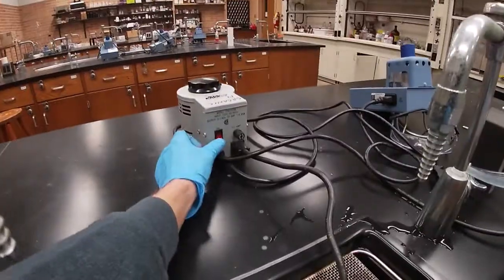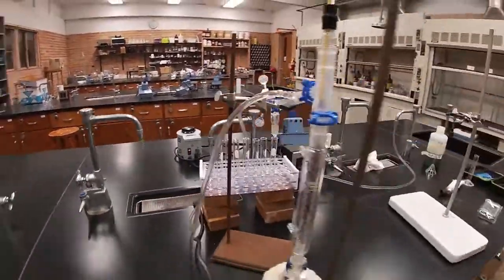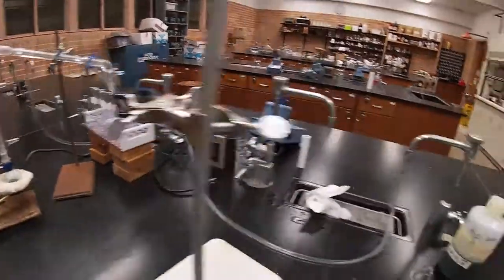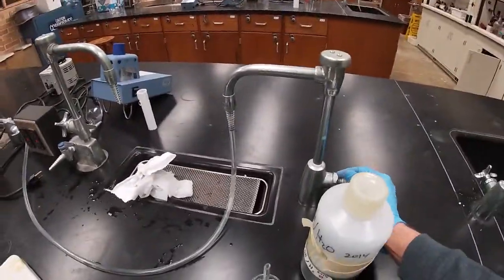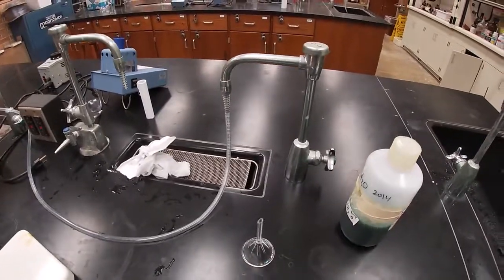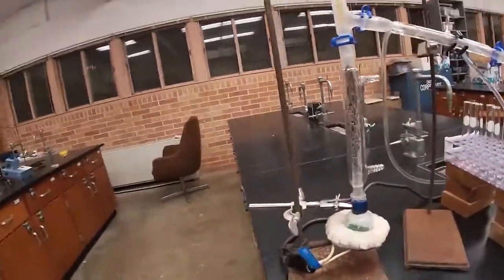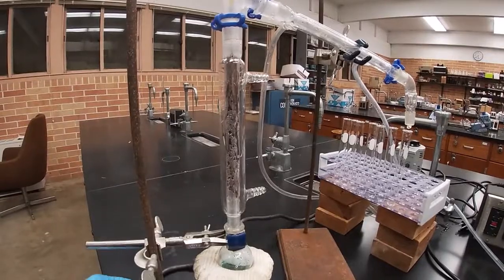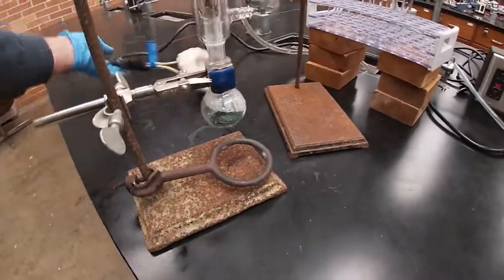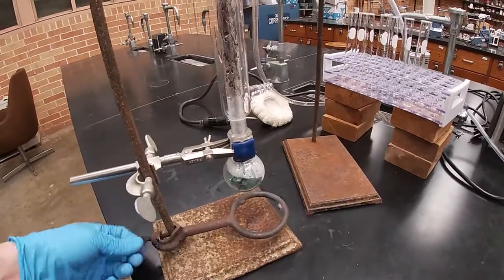So you turn off your variac, you unplug, and you make sure the water is turned off, okay? I'll lower the heat, okay? And I'm going to let this cool.